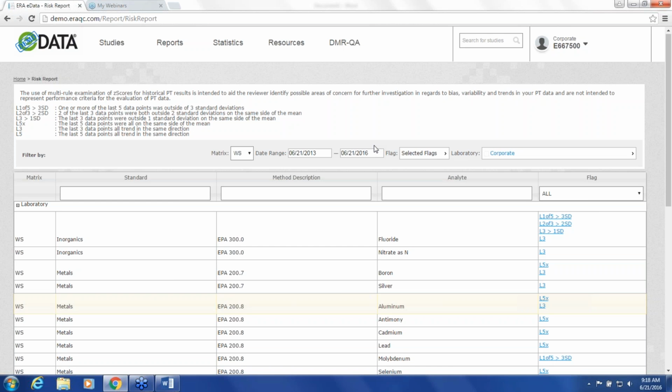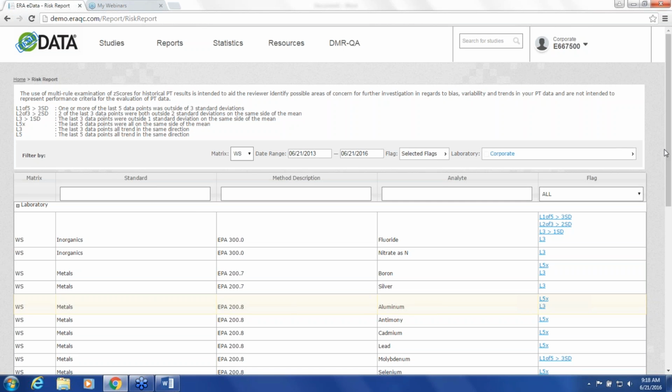So that's really it. That's the last of the report features that I wanted to share with you. Jason, have we had any questions come through? We have not. At this point, I would like to remind people, though, that all of these reports that we have shown you are fully exportable, so you can manipulate them as you need.